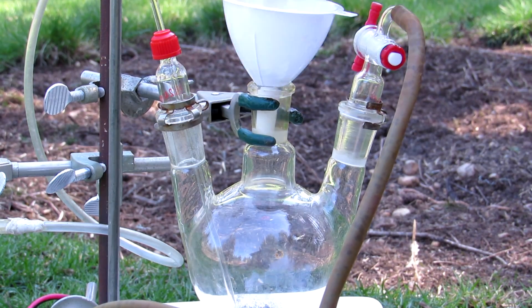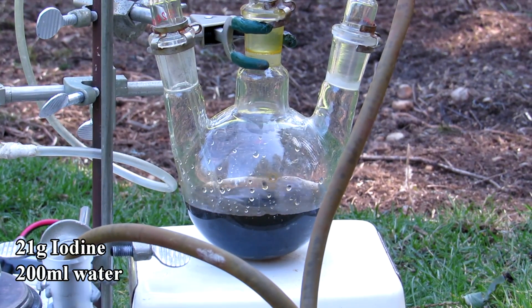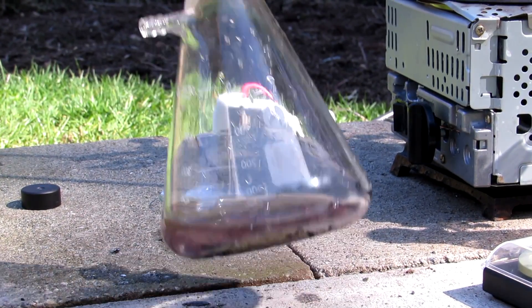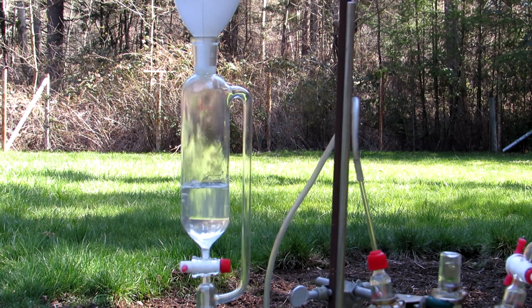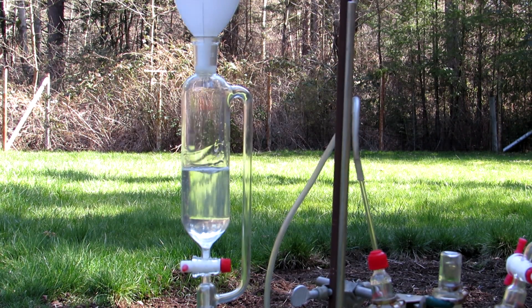With the apparatus assembled, around 21 grams of iodine and 200 milliliters of water were added to the round bottom flask with strong magnetic stirring. Then the iron sulfide was slurried with some water and added to the Erlenmeyer flask, and the addition funnel was charged with some concentrated hydrochloric acid. Hydrochloric acid can be purchased from hardware stores as muriatic acid.